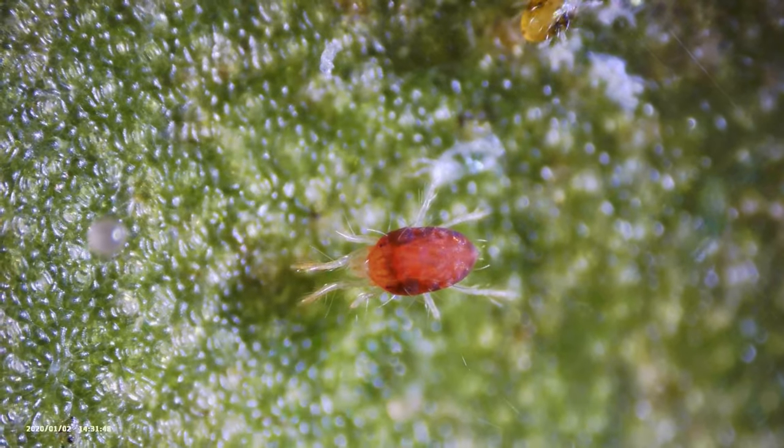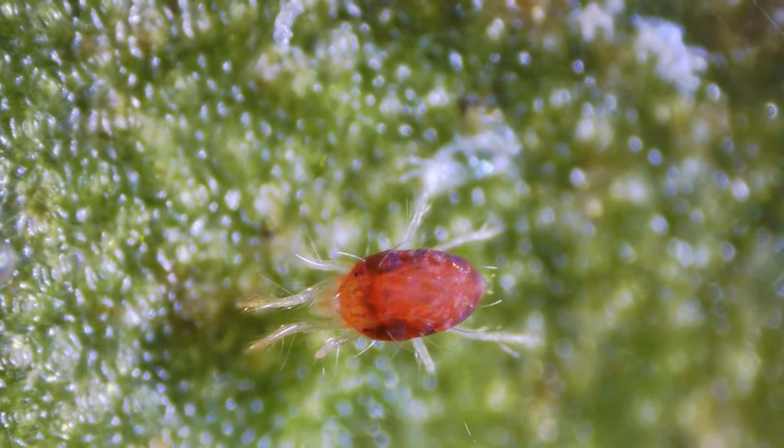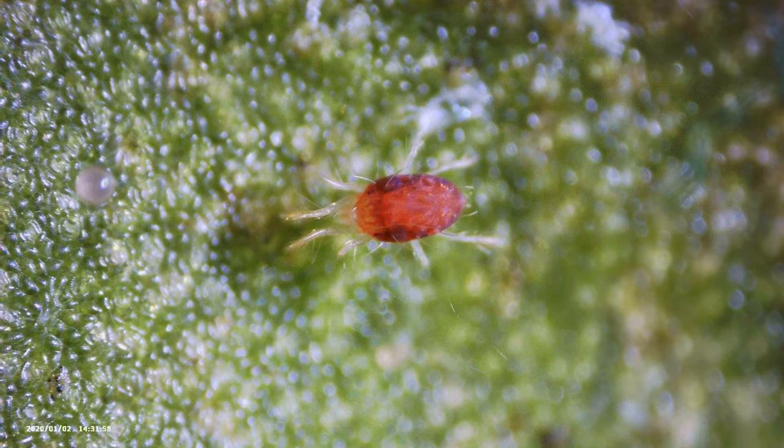These little guys start out as an egg, then hatch into a larva, followed by two nymph stages, and then the actual adult stage. They can start out non-red for a little while and turn red over time, so you might see some more pale-looking ones. Don't worry — those are also spider mites and you've got to watch out for them.